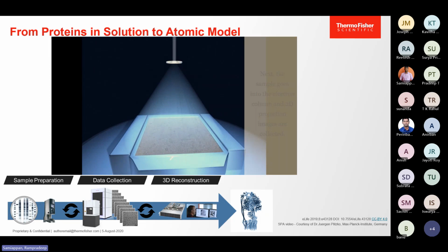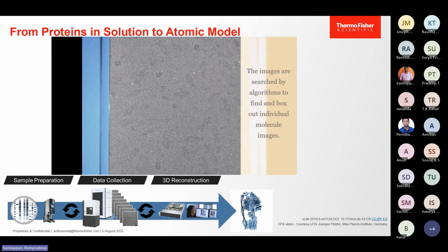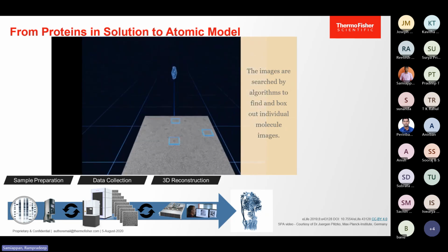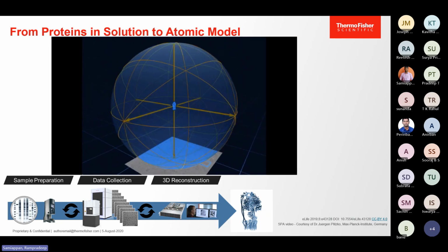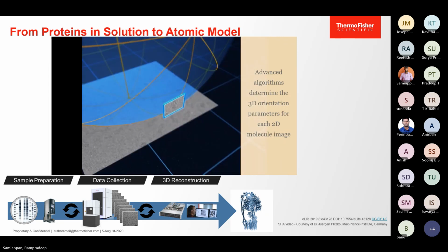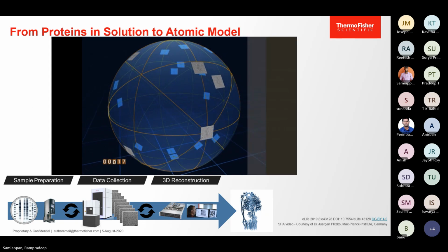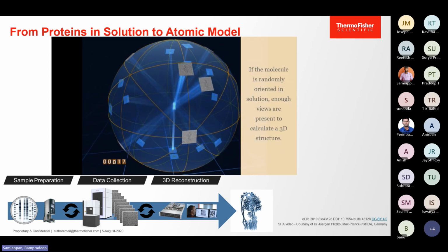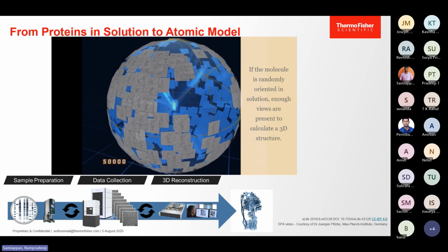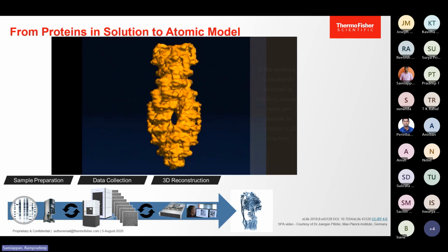This is exactly a representation of what I tried to explain: how quickly you can prepare the samples, and when it comes to data collection, and also the final 3D reconstruction with different image processing software. And right now, data collection goes really quick. Within a few days, you can get a result with a very good quality sample.